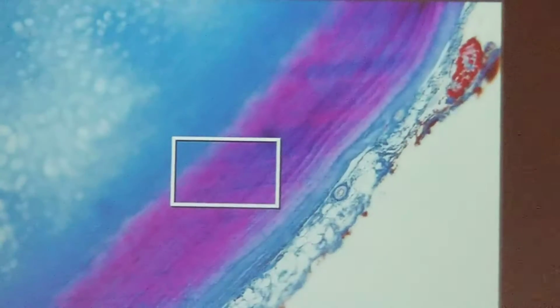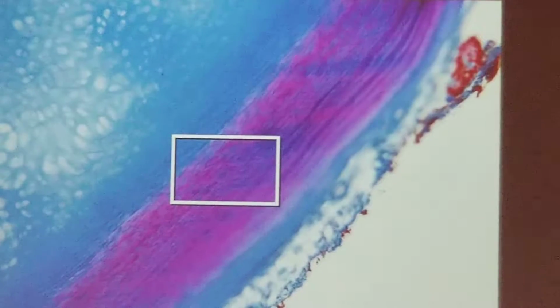Not really crazy about this sample that we have. The only thing is, it's very easy to distinguish just because it's so colorful. If you go to 10, you can see we've got blue, pink, purple, all kinds of colors in here. And if you go to 40, it gets distorted really badly. If you want to keep it at 10, you can do that.